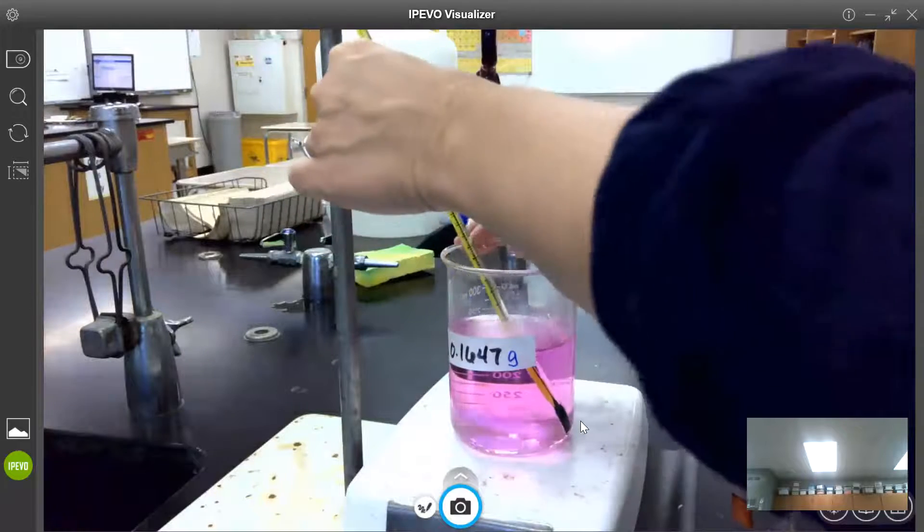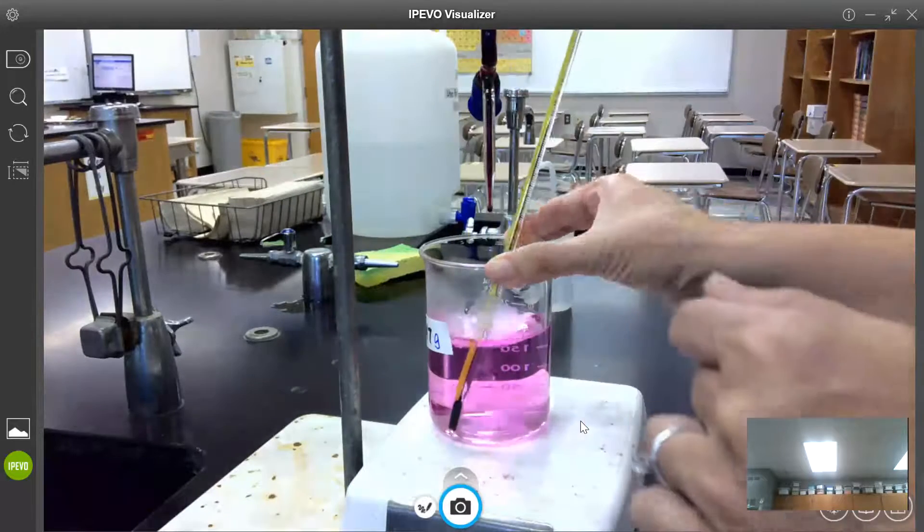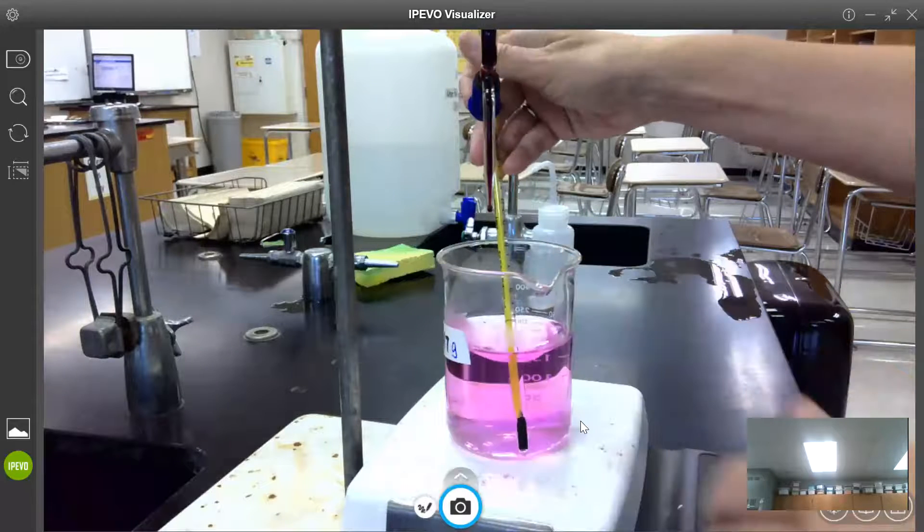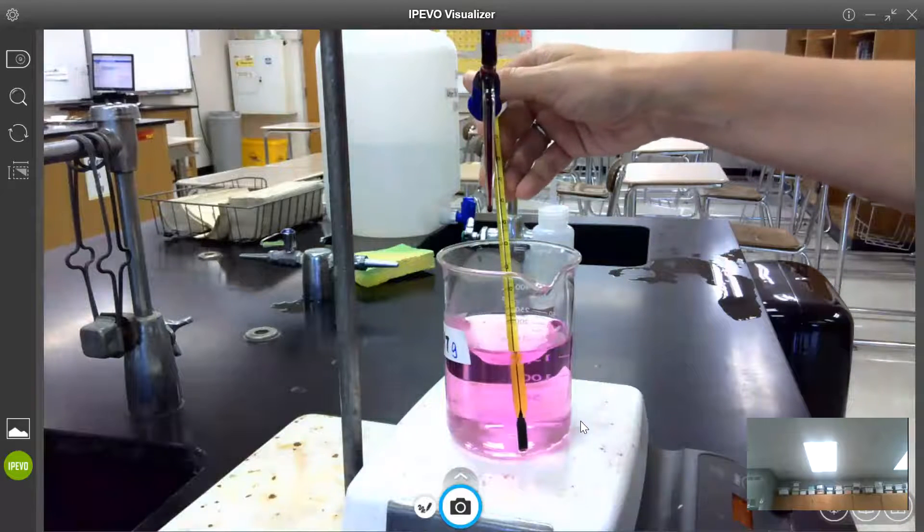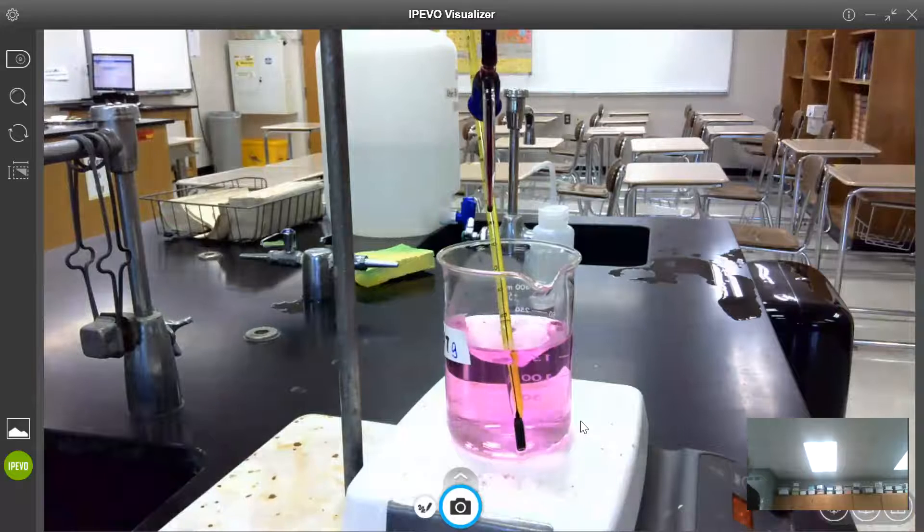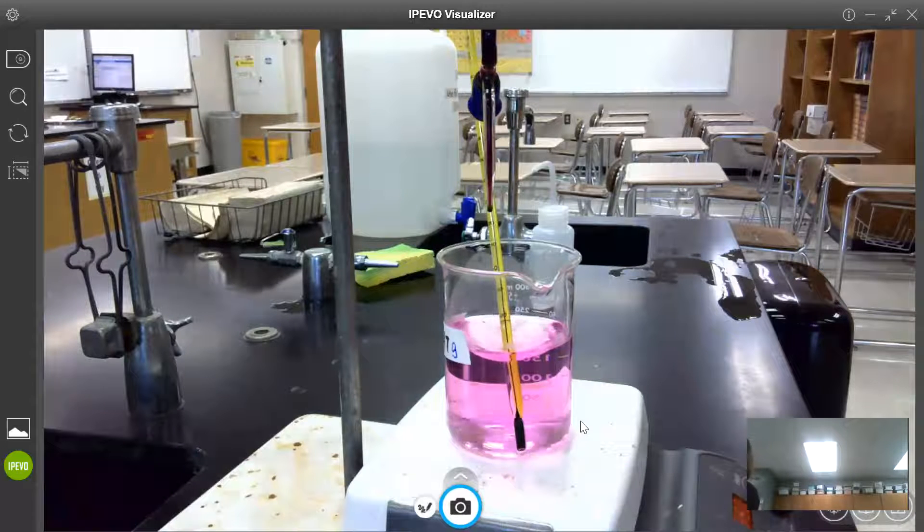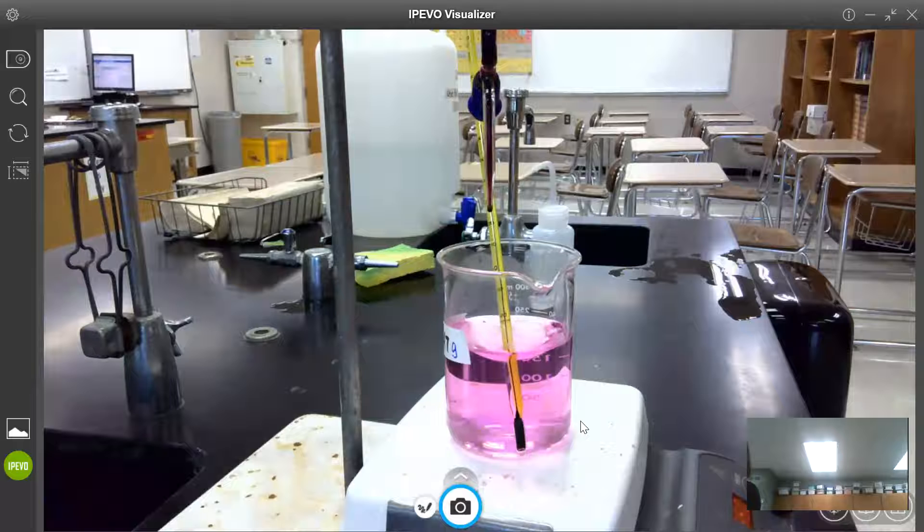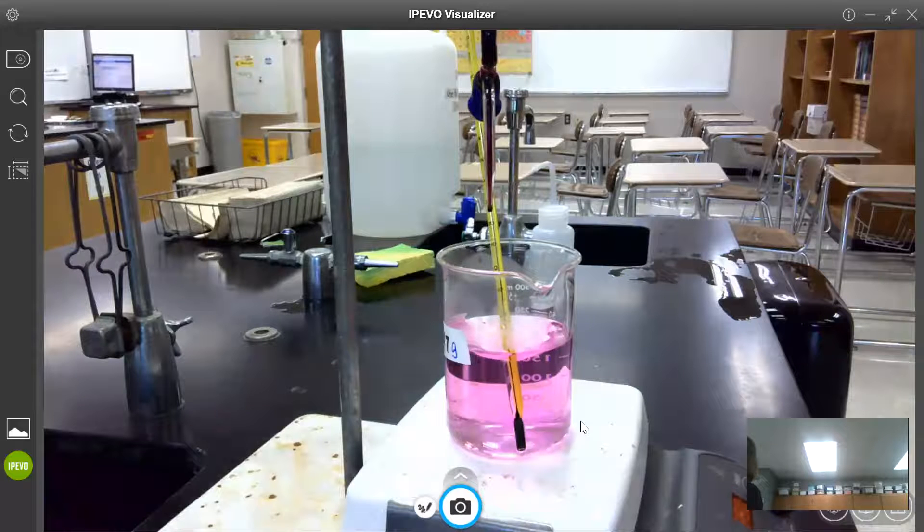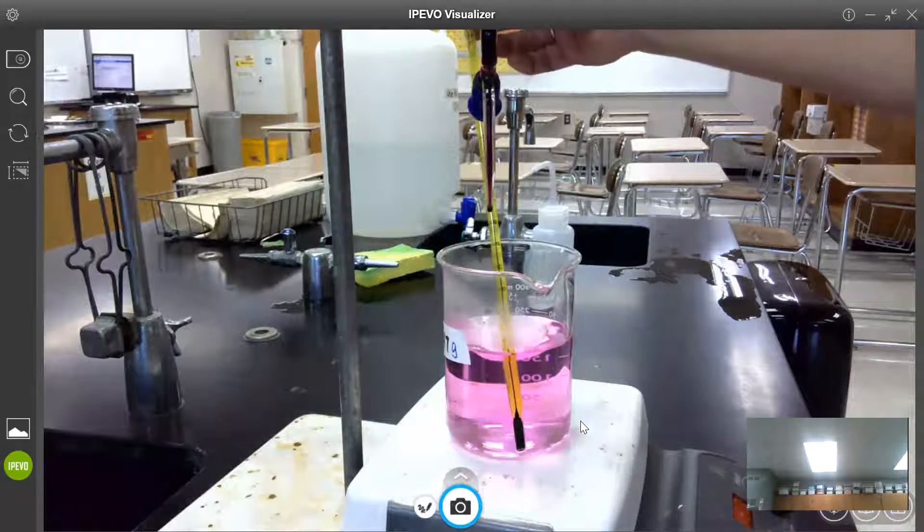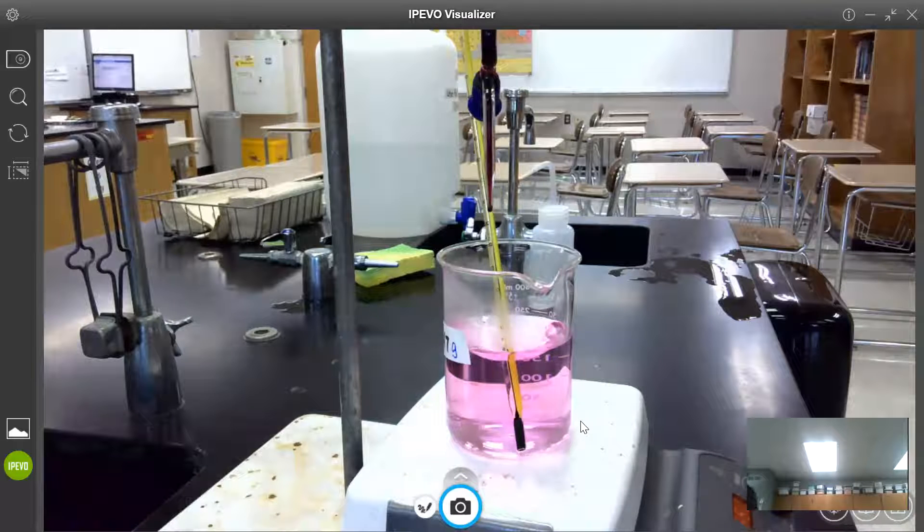All right and as it stirs we're going to see that color slowly dissipate as the KMnO4 reacts with the sodium oxalate. So you can see we're sort of going to colorless. So we're still stirring and we're still heating and right now the temperature is approaching 70 degrees.